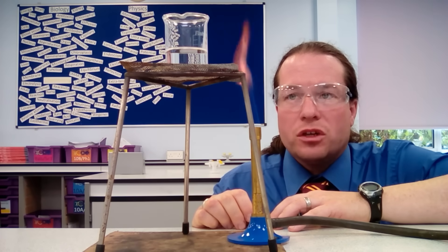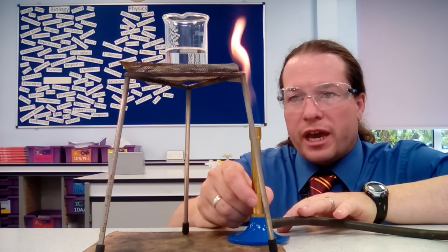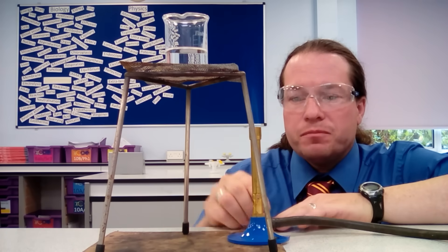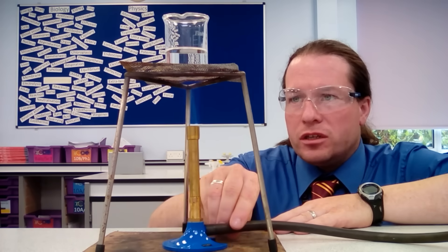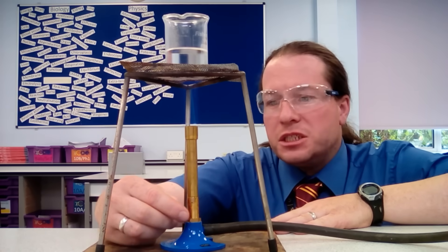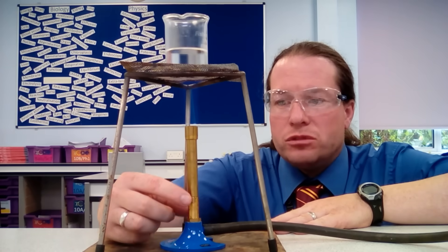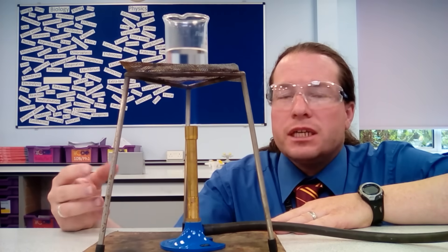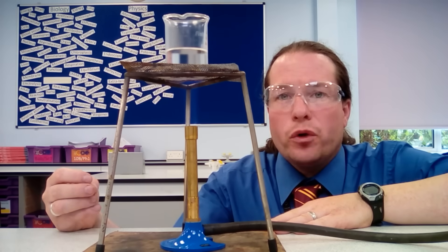Having lit the Bunsen burner on the safety flame, we open the air hole to get a roaring blue flame, then slide the Bunsen burner underneath. We want to heat the acid gently, so we don't open the air hole all the way, and we wait until it becomes nearly boiling.